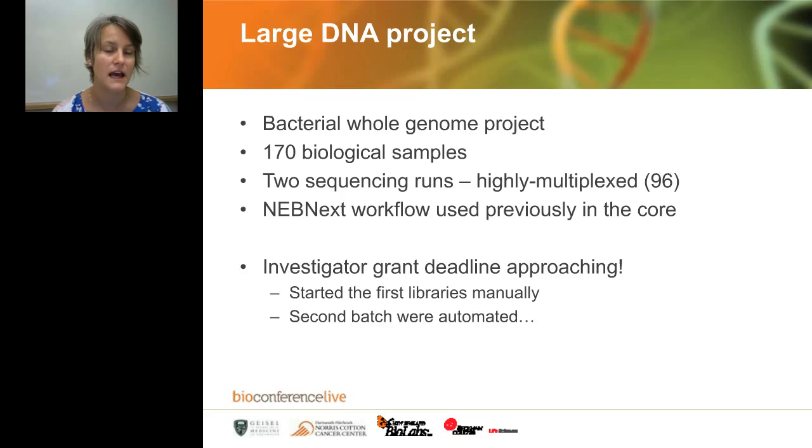We had used the NEBNext workflow in the core previously for projects before this, and we were happy with the workflow. We had generated good libraries, and so we decided that this was a good opportunity to try to automate this. Of course, with all investigators, they wanted the data as soon as possible, and with the grant deadline approaching, we actually ended up starting a lot of the libraries manually while Sarah was working on the methods. And so we have a very nice data set with a large N that we are able to compare because of this fortuitous time frame that we set up this experiment with.